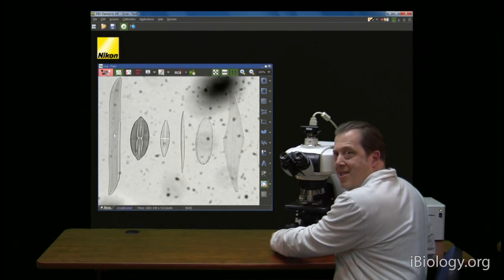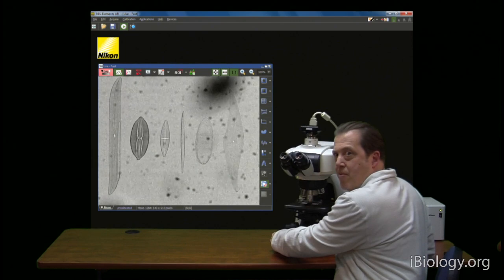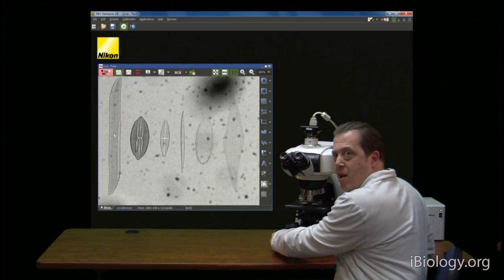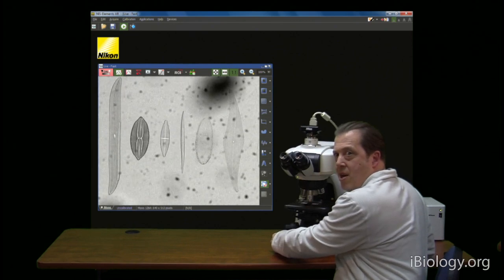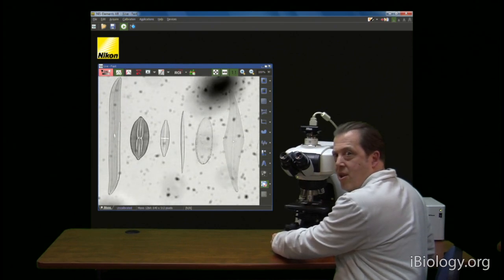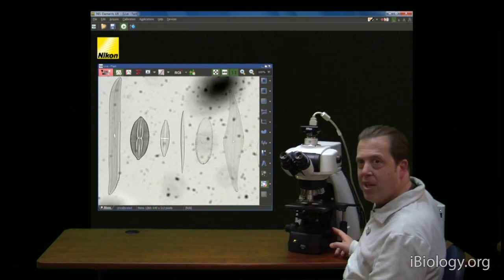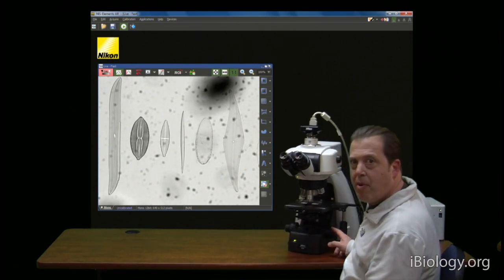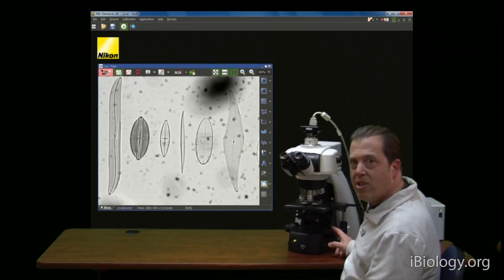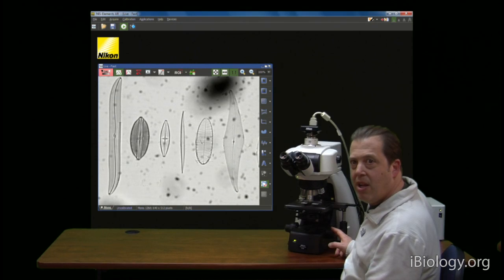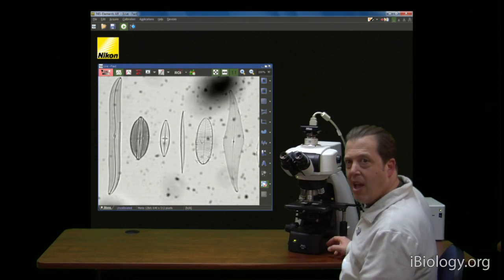So you can see that did eliminate a good bit of dirt that was in the optical system, but not all of it. So now you can still see those diatoms. Let's touch up our fine focus here a little bit.